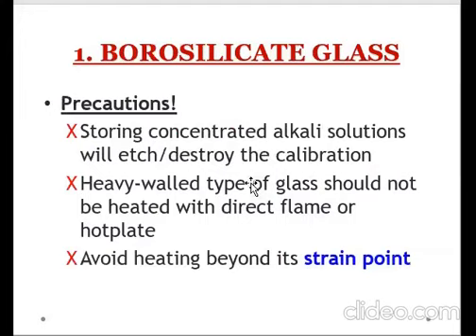First precaution po, okay, storing concentrated alkali solutions will etch or destroy the calibration of the glass. In other words, yes po, it is alkali resistant. Okay, it can resist the corrosion caused by the alkali, but may limit lahat ng bagay, correct? So same with your borosilicate glass, may limit din po siya. Pwede nyo siyang gamitin when you are dealing with alkali, pero hindi nyo pwedeng i-store yung alkali sa kanya. Especially if yung alkali na yon is very concentrated.